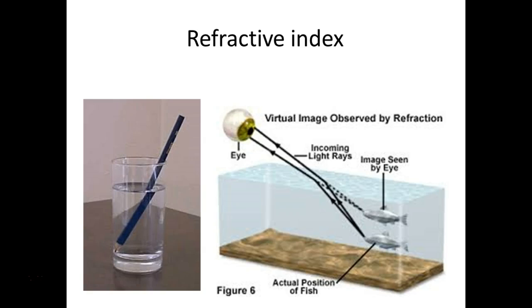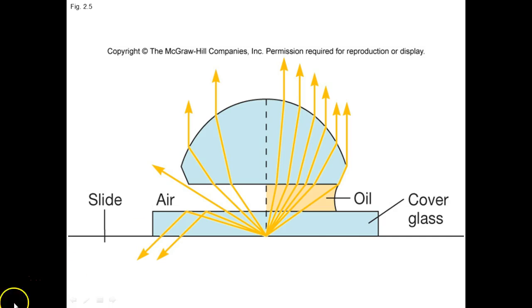So that creates a problem for our microscopes, right? Because we're using light. It's passing through air and glass slides. So here's your glass slide with maybe even a cover slip on it. If there's just air in between the ocular lens, then light can be scattered and not as much as you need to see a nice clear image enters into that objective lens. What we add is called immersion oil. It immerses the lens and the slide right in oil. This helps focus that light in because the light is going to be traveling the same speed as it was through the glass. So this oil has a similar refractive index, the speed of that light through that substance, as glass. Except it's not glass, right? It's malleable, and so it can move so that we can adjust.